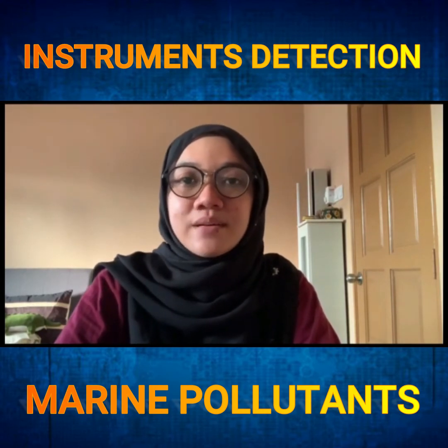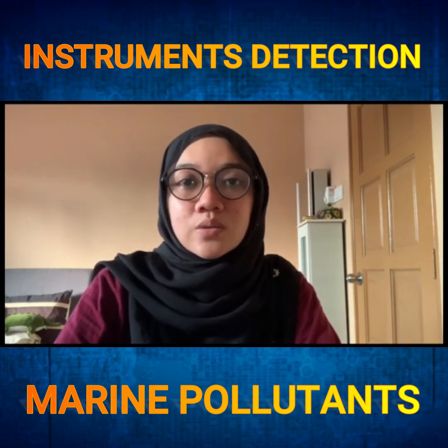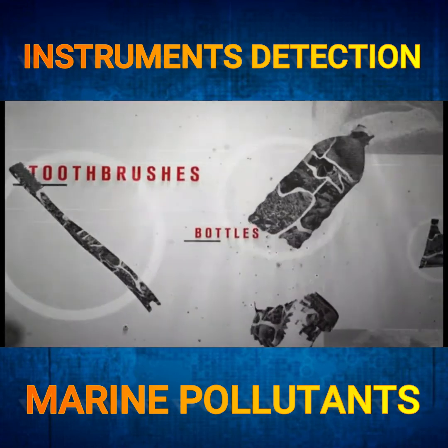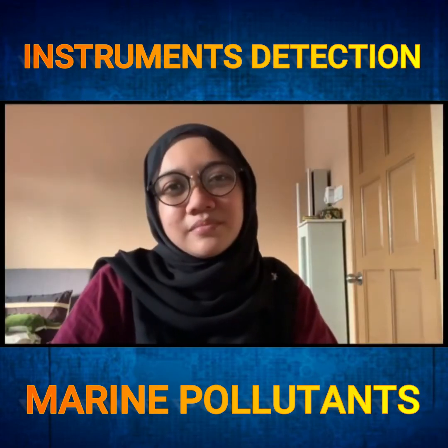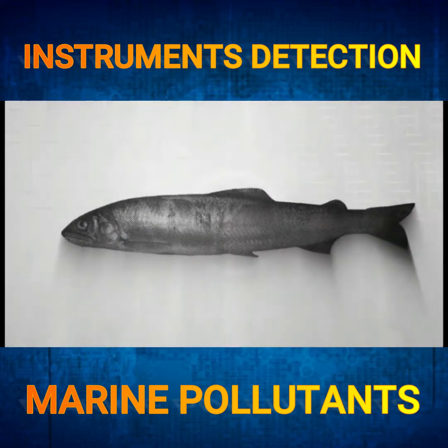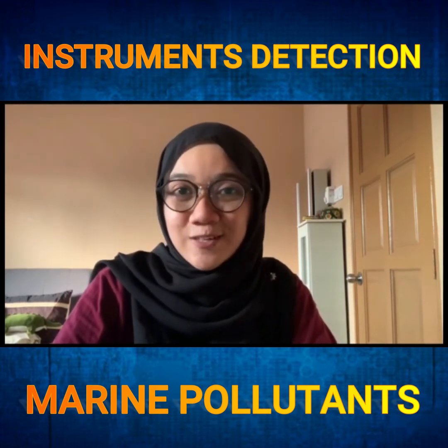Okay, so the next instrument is Fourier transform infrared spectroscopy, or simply known as FTIR spectroscopy. This instrument can be used to identify microplastic. What is microplastic? A microplastic is a small piece of plastic with a size of less than 5 mm, which comes from various sources such as wrappers and bottle caps. Abundance of microplastic can cause several harmful physical effects on humans and other living organisms through mechanisms such as entanglement and ingestion. Okay, let's go back to our main topic, which is FTIR spectroscopy.